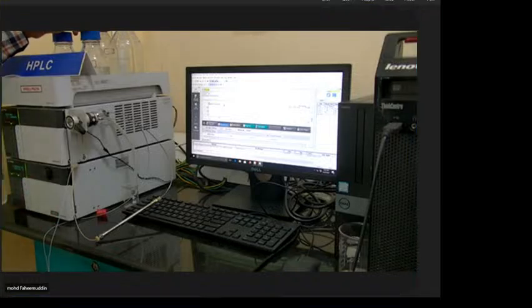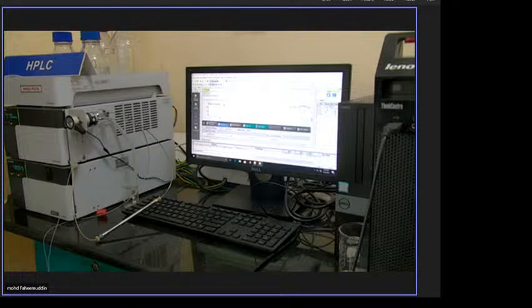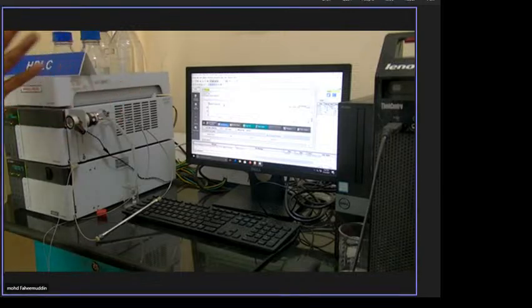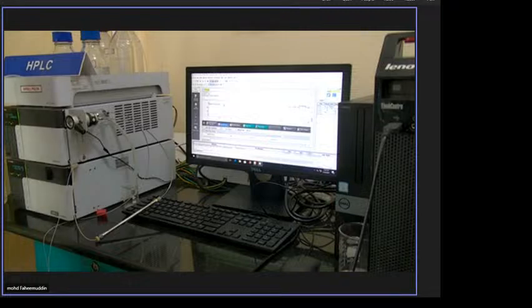1:1. But I am not disturbing the concentration during the entire experiment. It is called isocratic elution, because even though the solvent is a mixture, I am not disturbing the concentration ratios. For example, the time is 10 minutes. For the entire 10 minutes, I am not disturbing, the same solvent I am pumping. This is called isocratic elution.